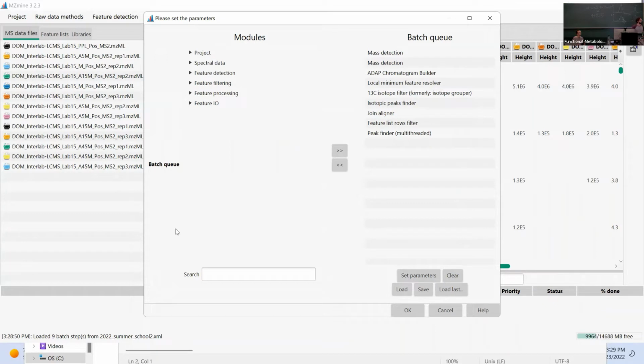Maybe to add a couple of parts to that, because I think this is a really critical moment for us to proceed with all the other tools downstream. That feature finding, I know it's complicated, but it's also very central, because if you mess this up here, then everything downstream might not go as expected. So I think it's really important, for the sake of the learning experience of the other modules, that we get good results out of it. Robin and Stefan walked you through each single step, and I hope that you now understand what's happening under the hood.